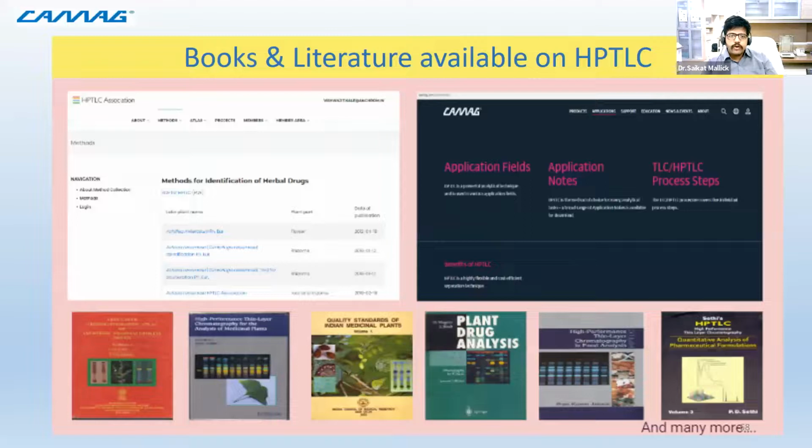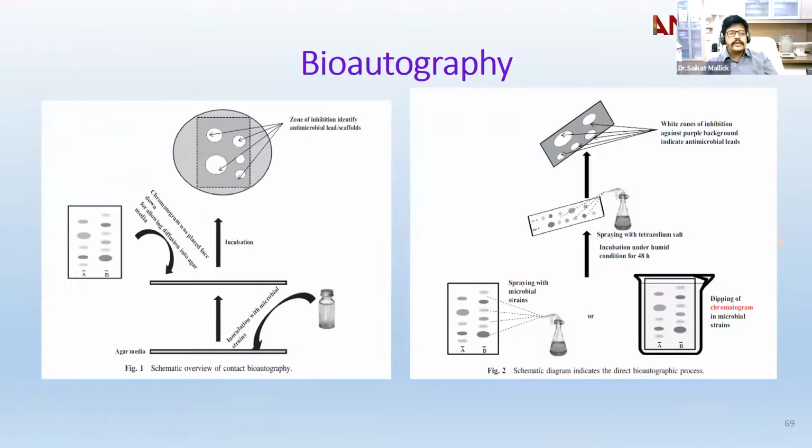And now let us move on to the bioautography part. The earlier work which I showed you was a complete HPTLC kind of work. Now let us talk about a little bit of the microbial part. We are not specialized in the microbial aspect, but still, with a few years of knowledge, we have been able to understand this phenomenon, and I would like to share how it works.